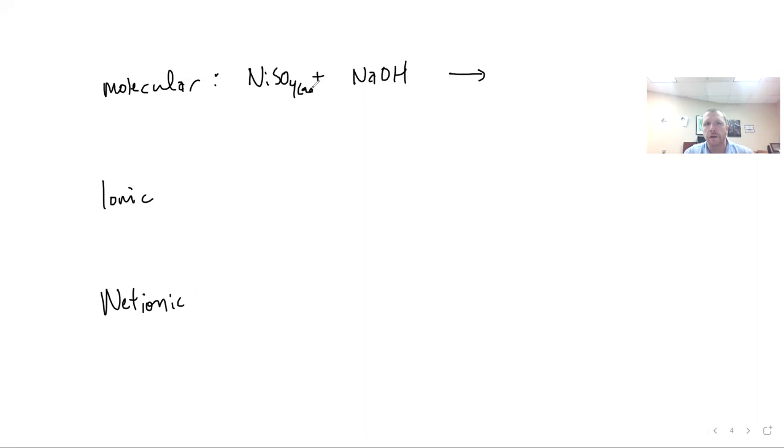We've got aqueous nickel sulfate, aqueous sodium hydroxide. We have kind of the model of AX and BY. You're going to mix those to make AY and BX. Okay, so that would give me NiOH.